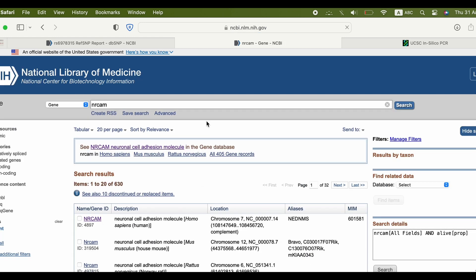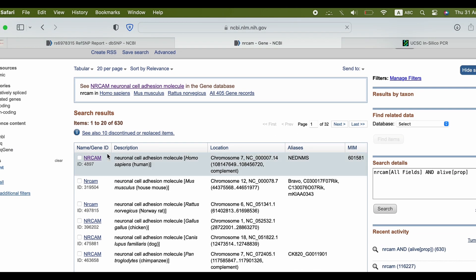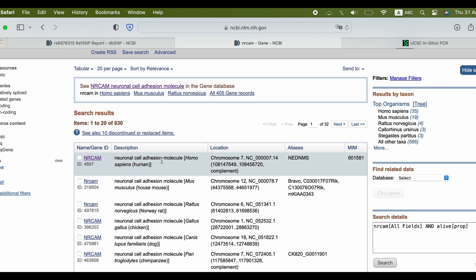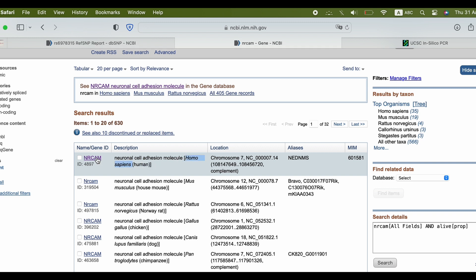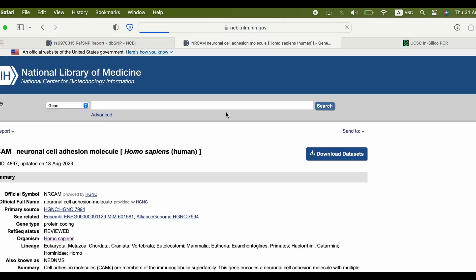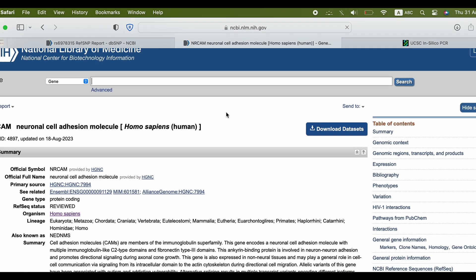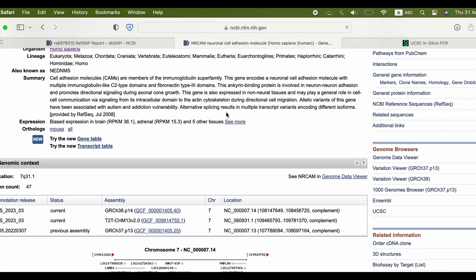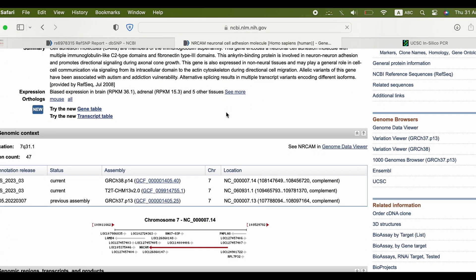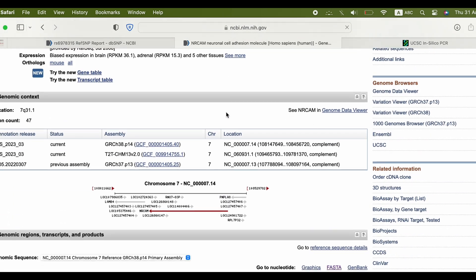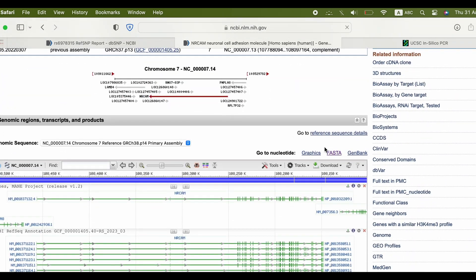Select the species you're interested in. It's usually Homo sapiens. Then select FASTA, and the website will show you the whole sequence of the gene.